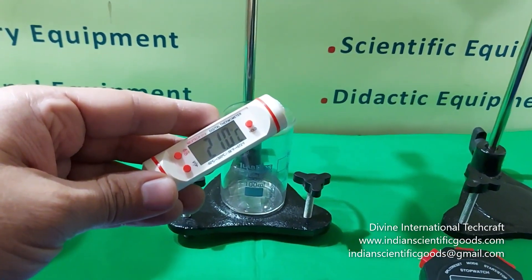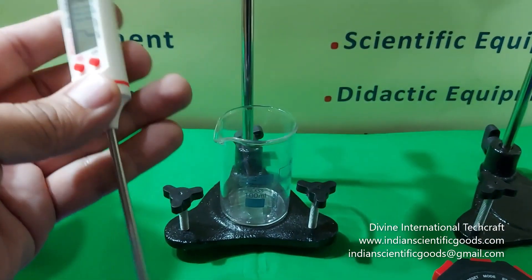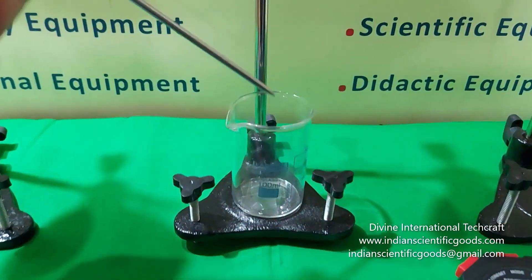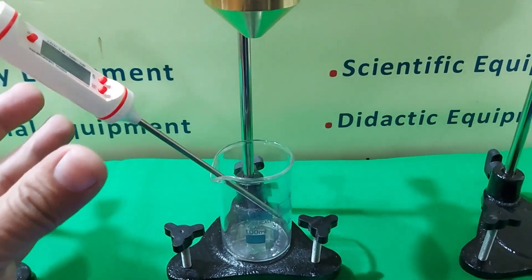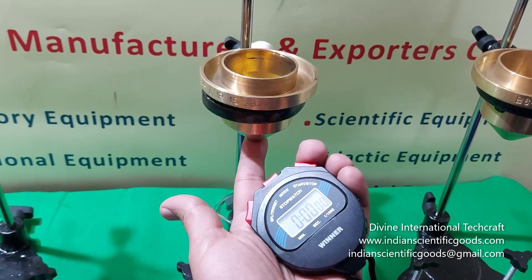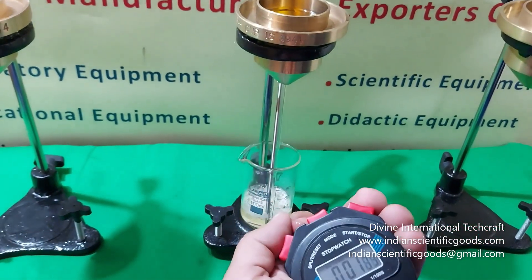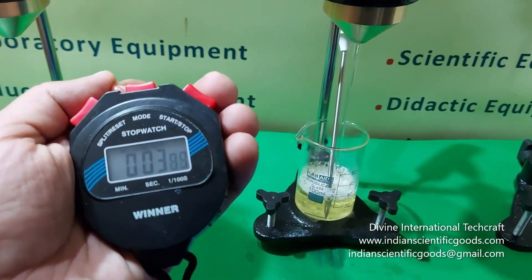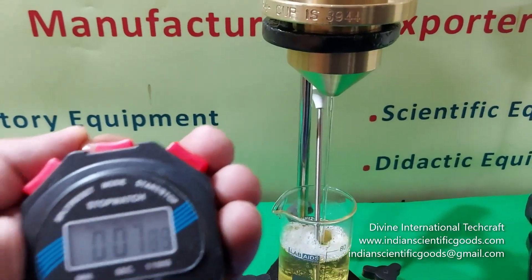Measurements are normally taken at approximately 20 to 21 degrees centigrade. A thermometer is placed in the receiver flask or beaker below the Flow Cup. The flow time is recorded using a stopwatch. The stopwatch is started when the finger is removed from the orifice and is stopped when the first break in flow occurs in the stream of sample close to the orifice.